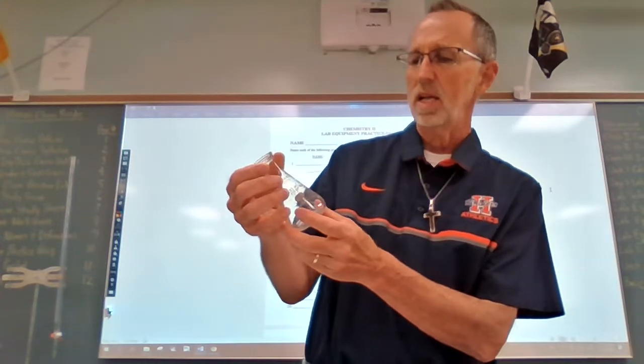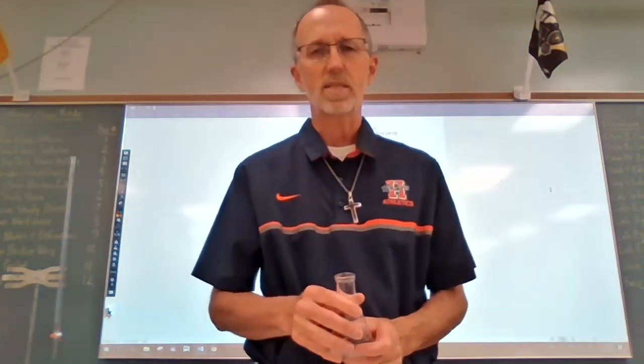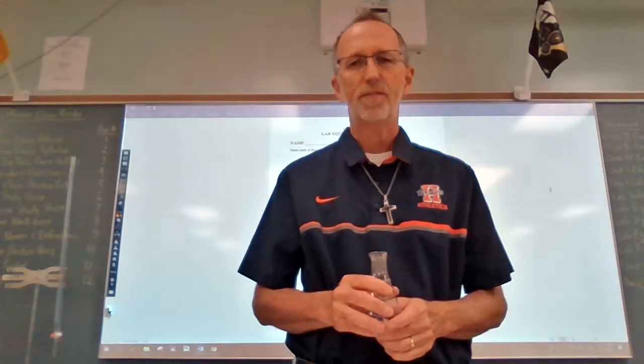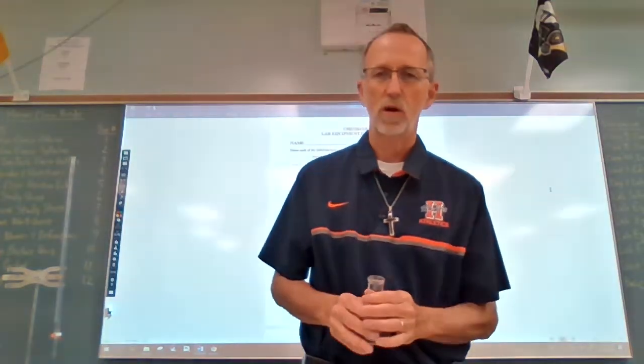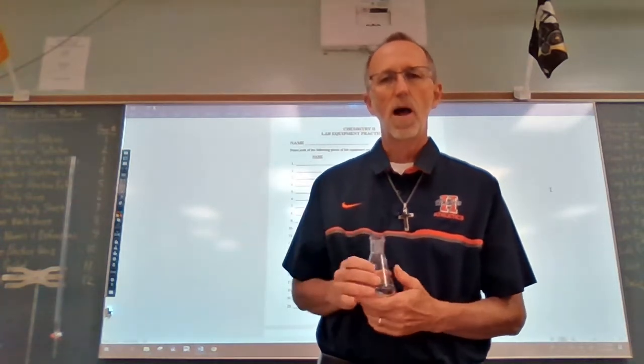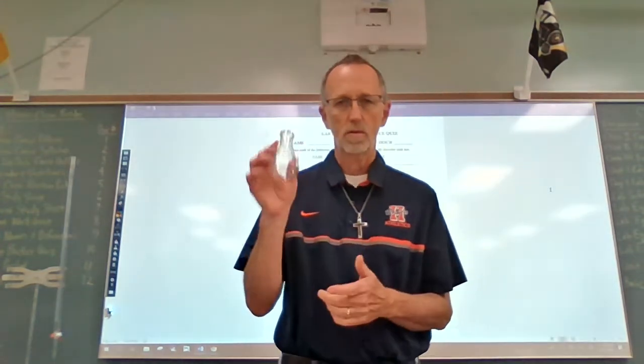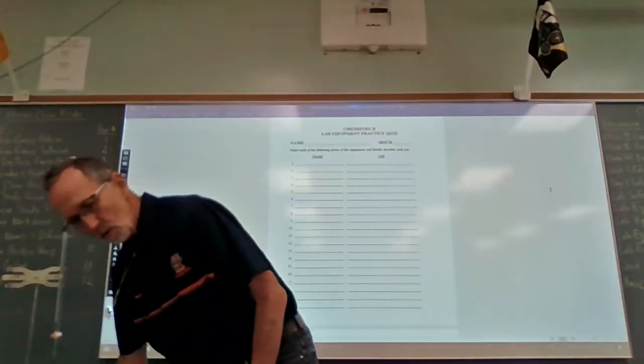In fact, right here, it says plus or minus 5%. So what that means is, the actual volume could be 5% higher or lower than what you read it, depending on how you read it. So these will give you an approximate volume, but we absolutely do not use them to measure volume. Okay, so this is an Erlenmeyer flask.